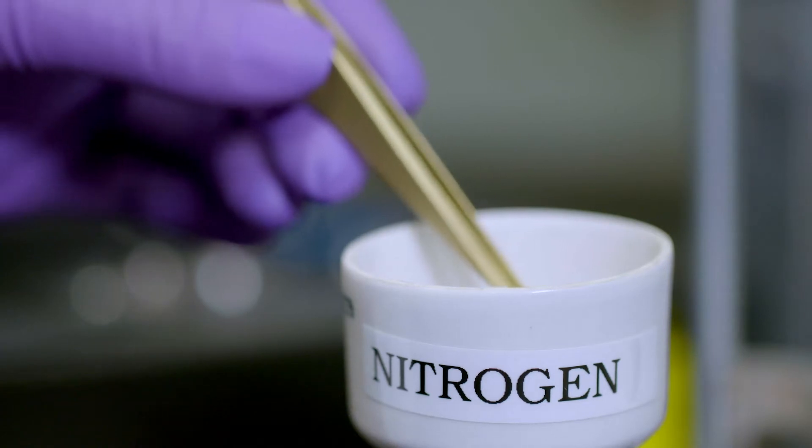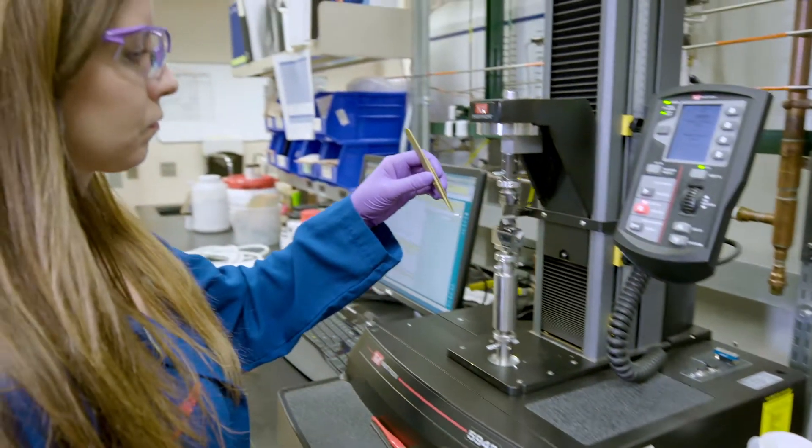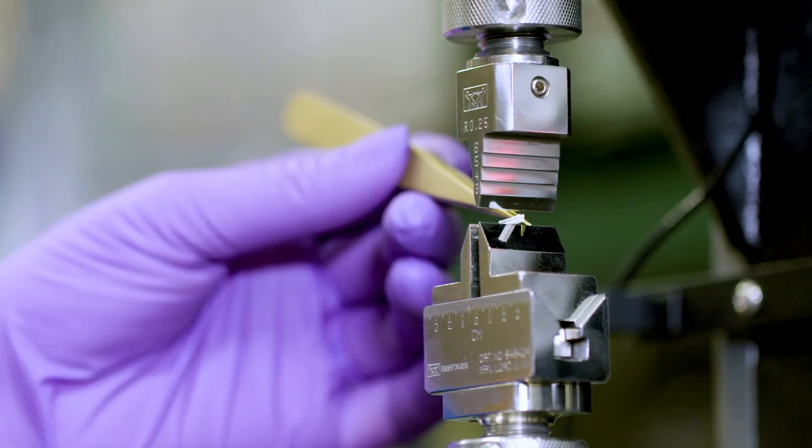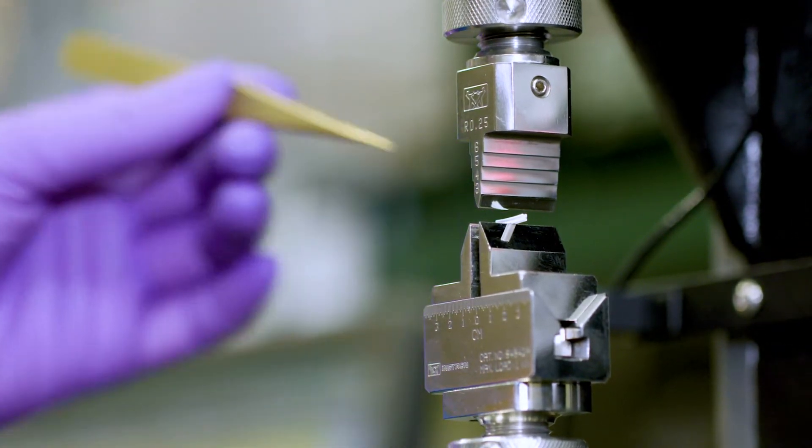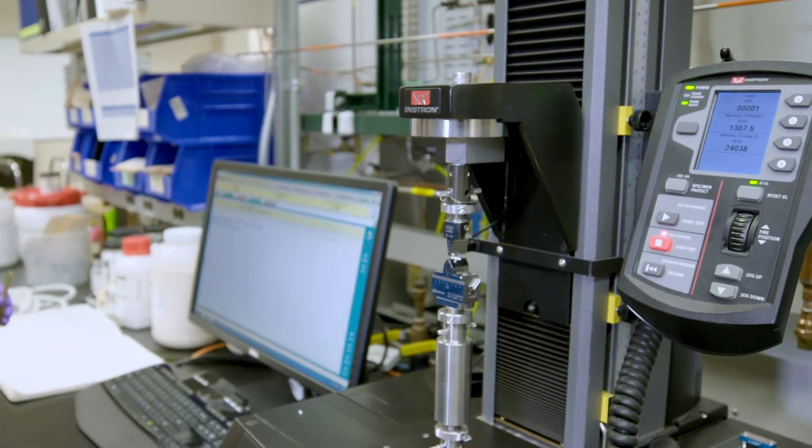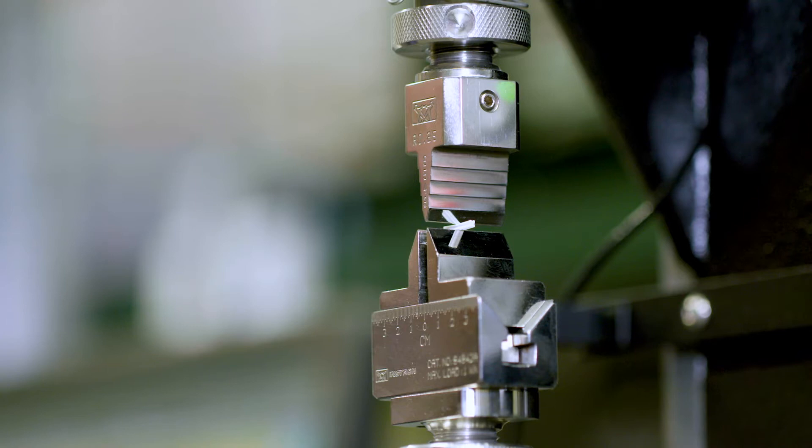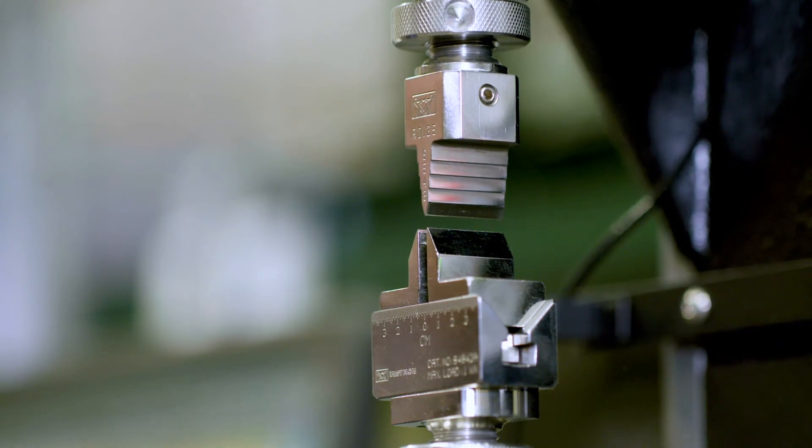Once the catalytic characterization of the catalyst has been determined, skilled ExxonMobil engineers test the physical properties of the catalyst. This equipment measures how the catalyst performs under pressure. This is a real-life simulation that allows scientists to determine how the catalyst will cope in the environments in which it will eventually be used.